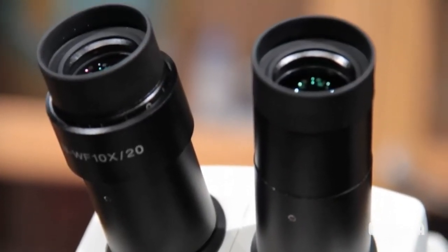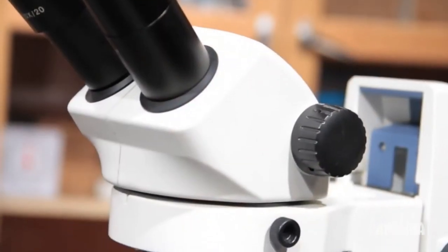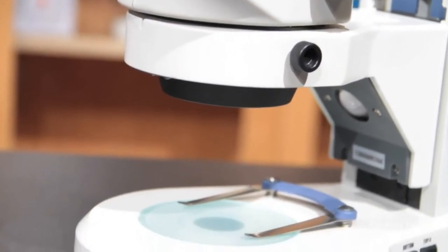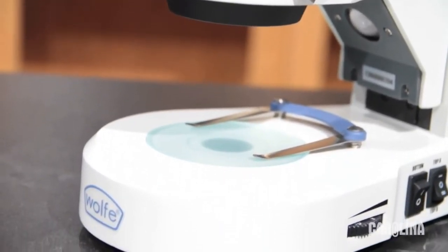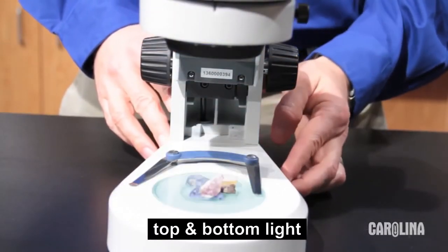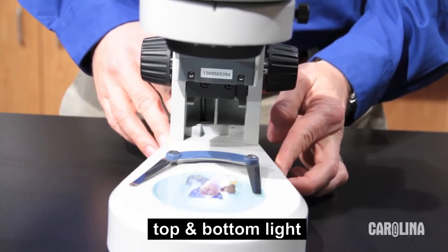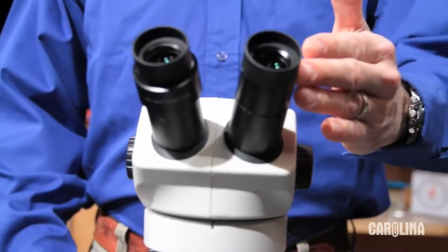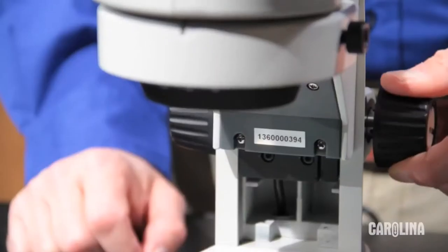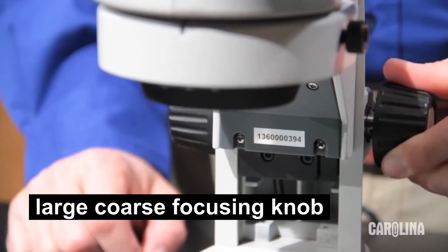Now, let's take a look at the important part. Stereo microscope has two eyepieces and two objectives so that you can see in stereo. Next, it has top and bottom light and is used mostly for viewing solid specimens. The different parts include the binocular eyepiece, the top and bottom light, the illuminated bottom stage, large coarse focusing knob, and the large working distance.